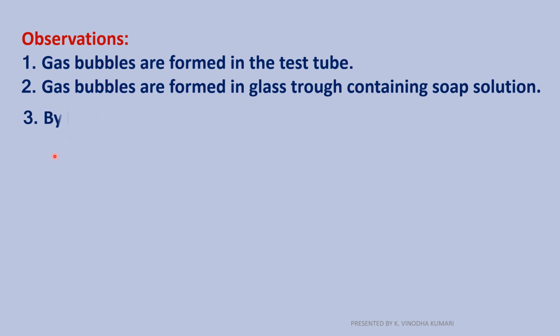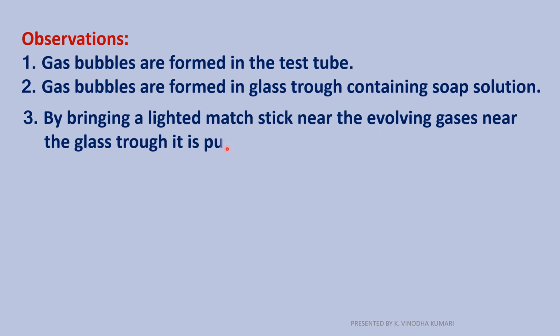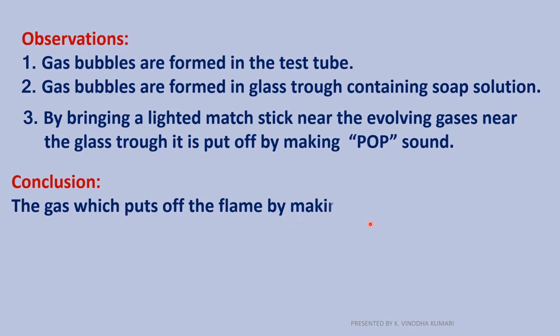Now we have to test those evolving gases by bringing a lighted matchstick. We have seen that the lighted matchstick was put off by making a pop sound whenever it is brought near the evolving gases. Now we can make a conclusion. The gas which puts off the flame by making a pop sound is hydrogen gas.